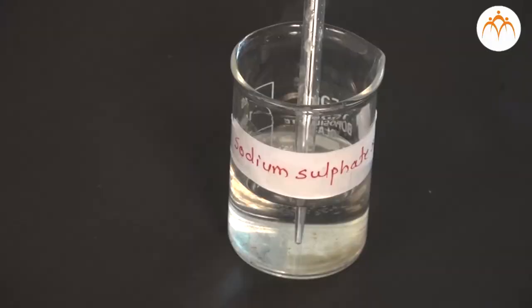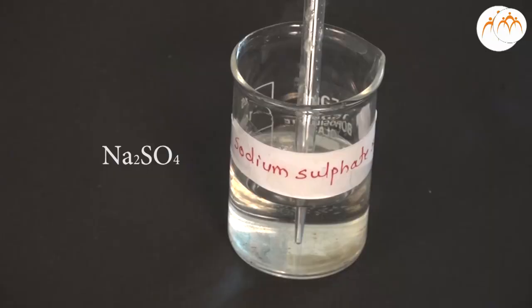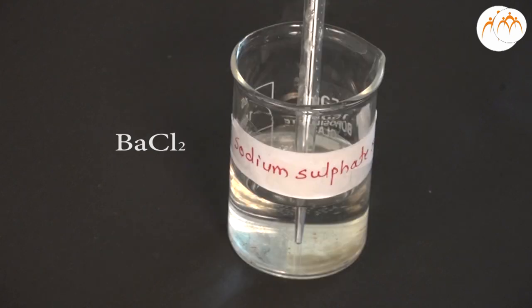Double displacement reaction: Let us see the reaction between sodium sulphate and barium chloride. Requirements for the experiment are sodium sulphate, barium chloride, and test tube. The colour and appearance of both sodium sulphate Na2SO4 and barium chloride BaCl2 are clear and transparent.